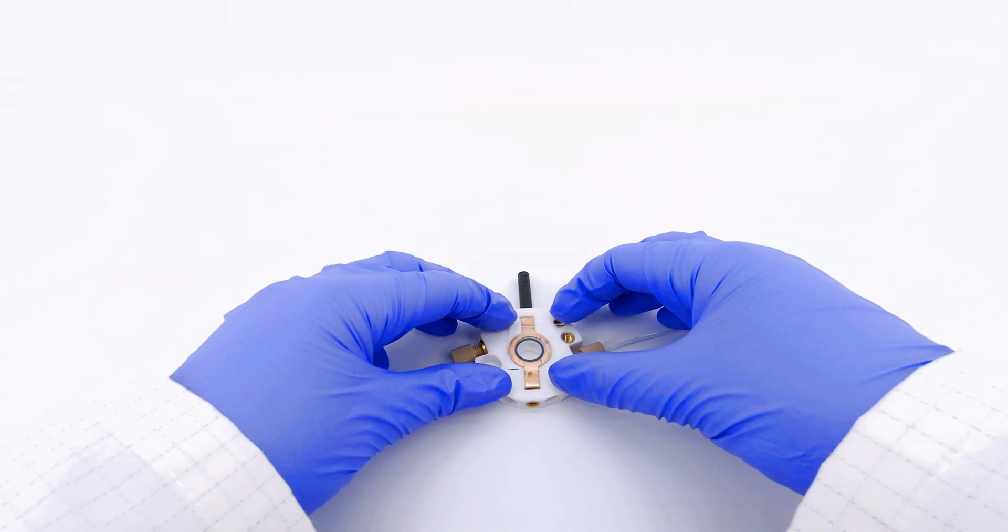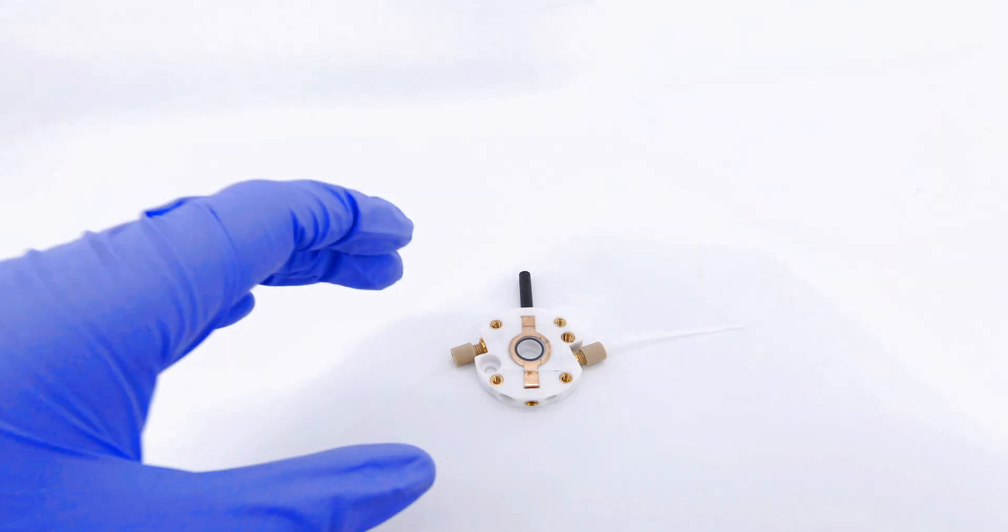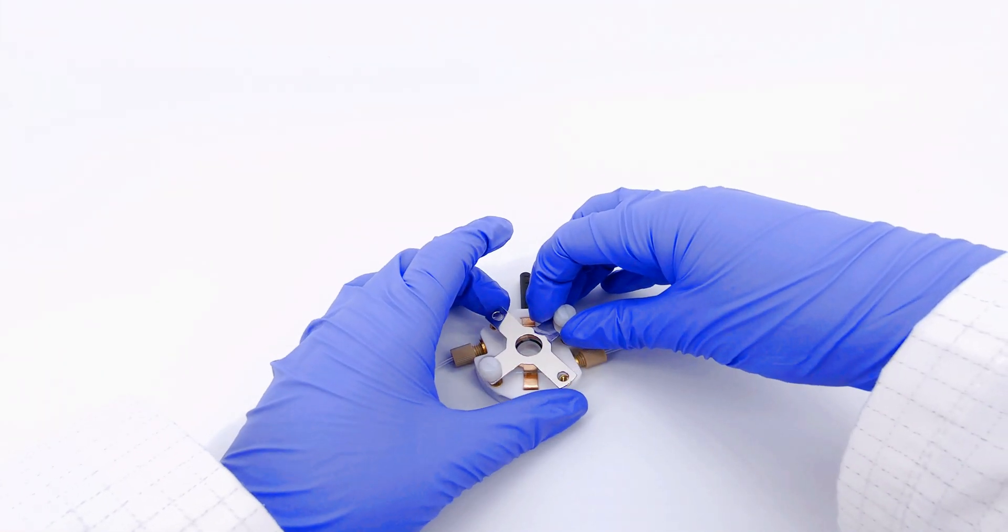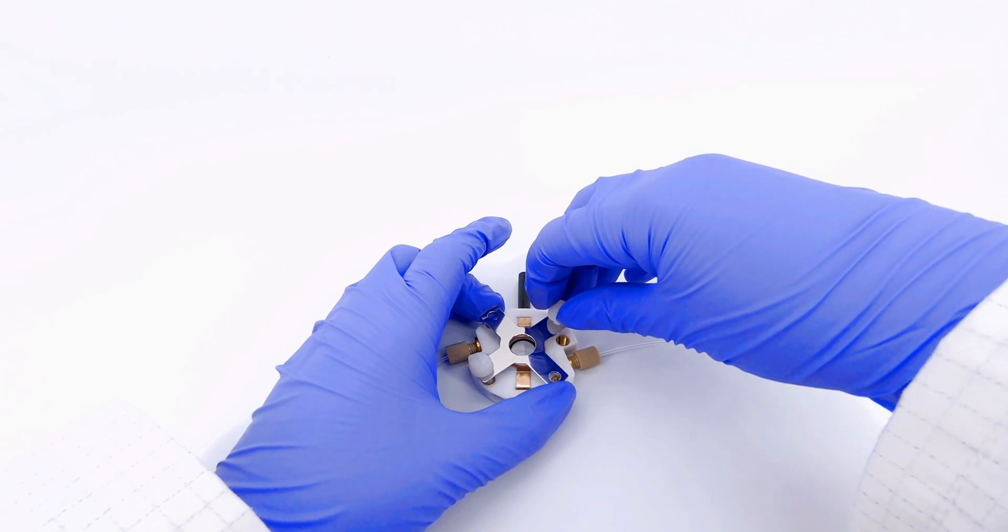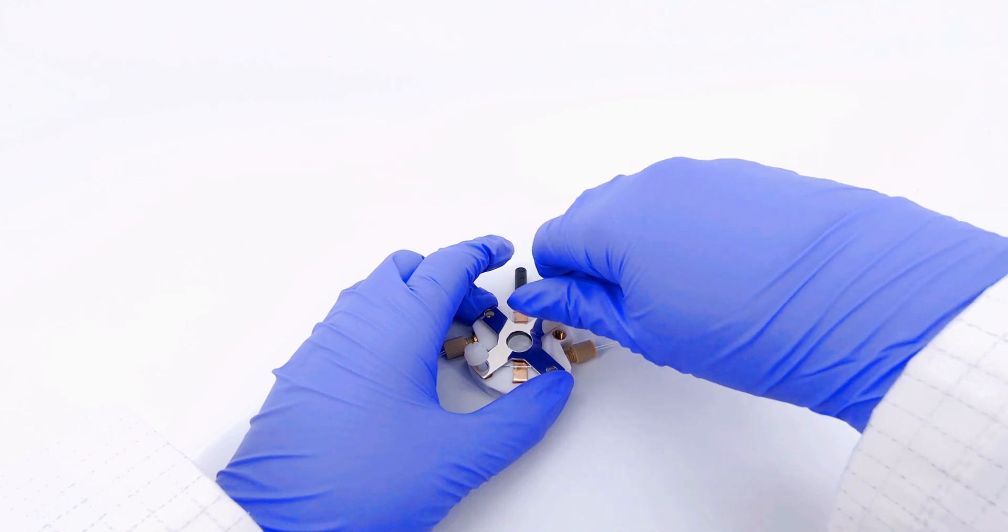Place your photo electrode substrate such that the electrically conductive surface is touching the contact. Next, secure the substrate using the sample holder and associated thumb screws.